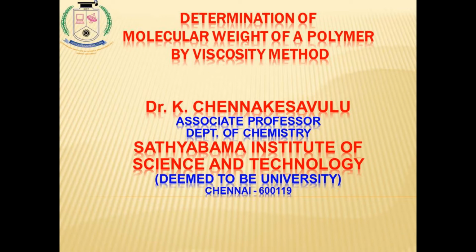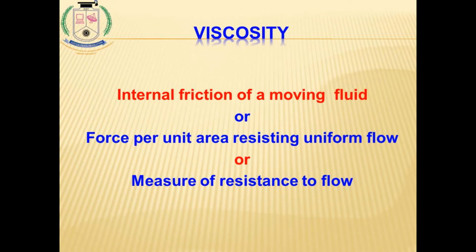Before doing the experiment, it is our duty to discuss viscosity. What is viscosity? We can consider it as the internal friction of a moving liquid. That is one definition.